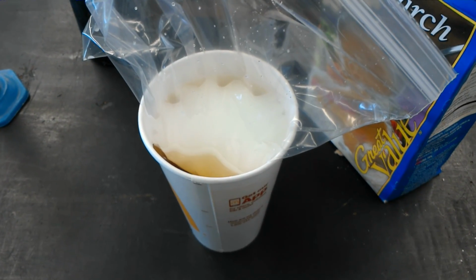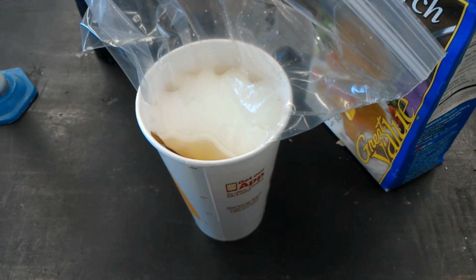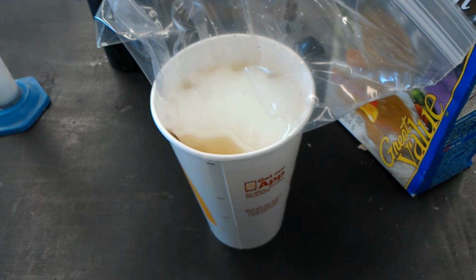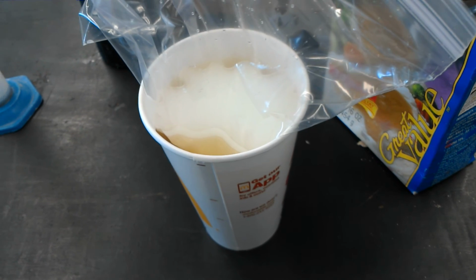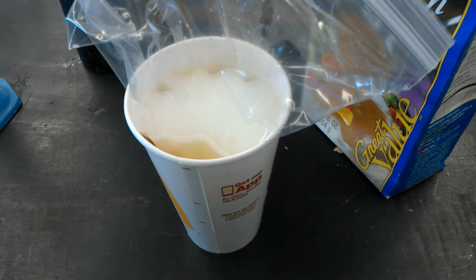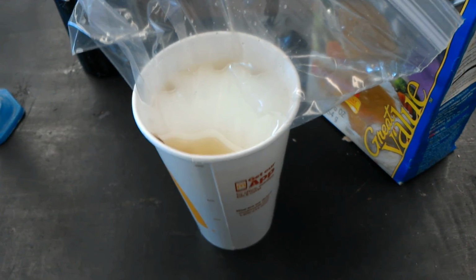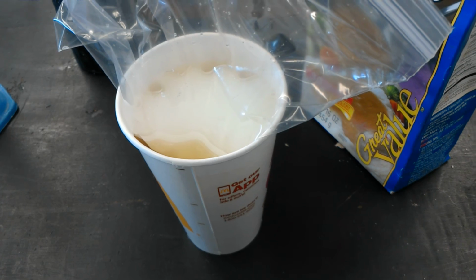At this time, I would like for you to write a hypothesis on, do you think anything is going to happen? Do you think there's going to be any color change? Is there going to be any indicator that iodine has come into contact with the starch? And if so, how do you know? And which direction do you think it's going to flow? Do you think starch is going to come out of the bag? Do you think iodine is going to go into the bag? Or do you think nothing's going to happen? And again, if so, why?